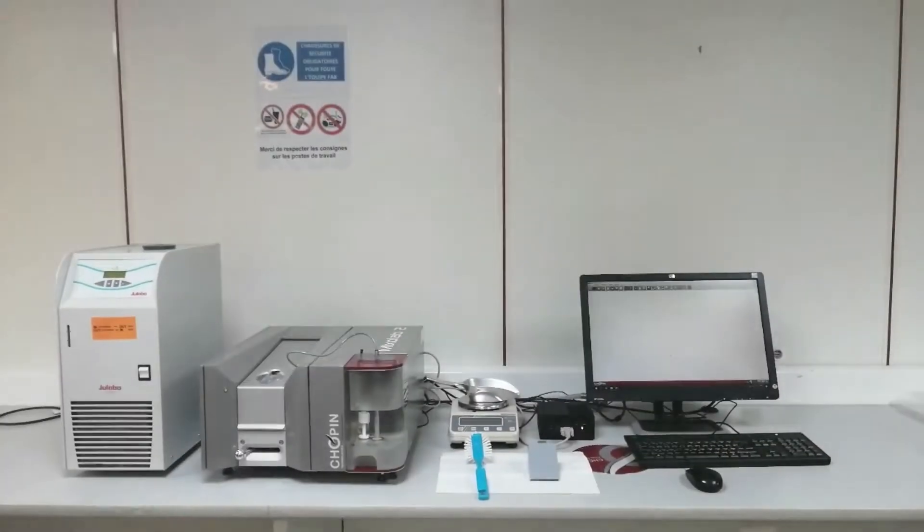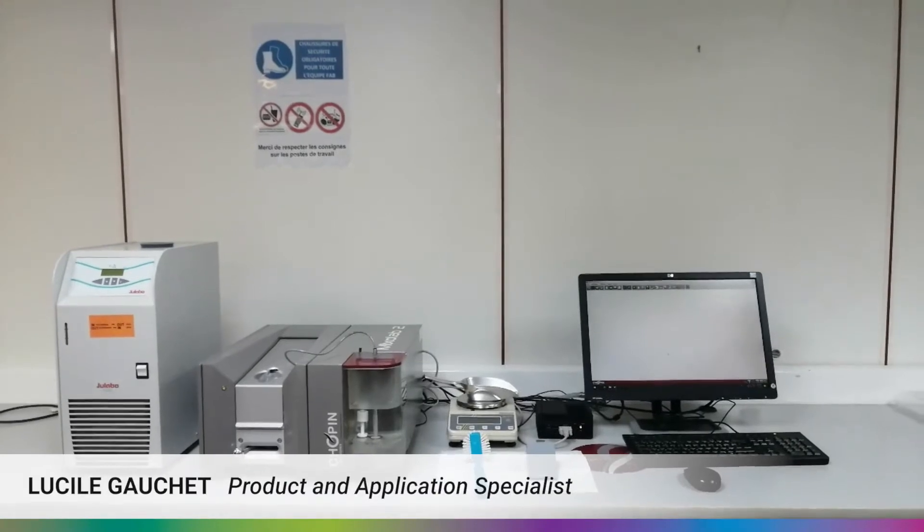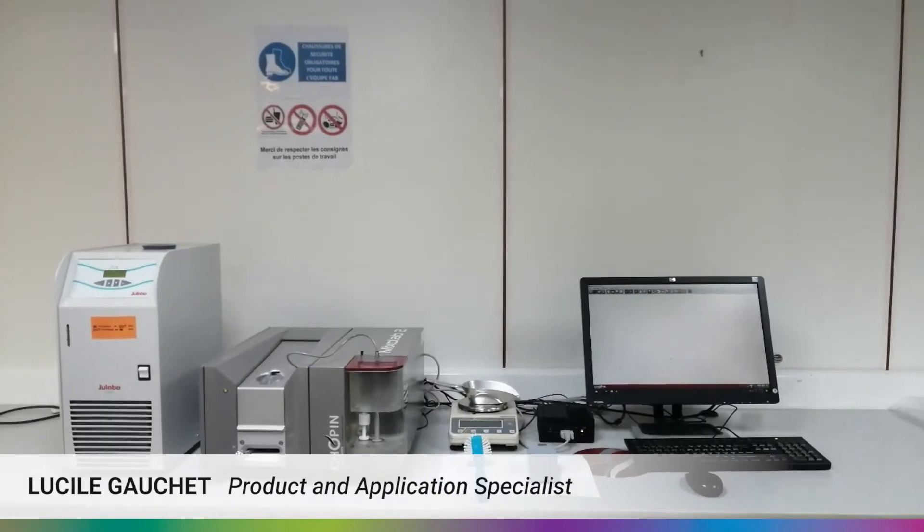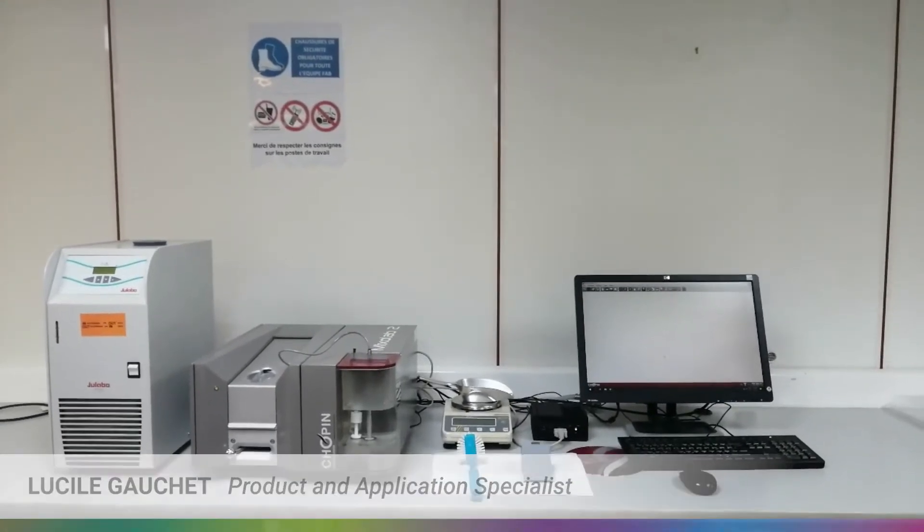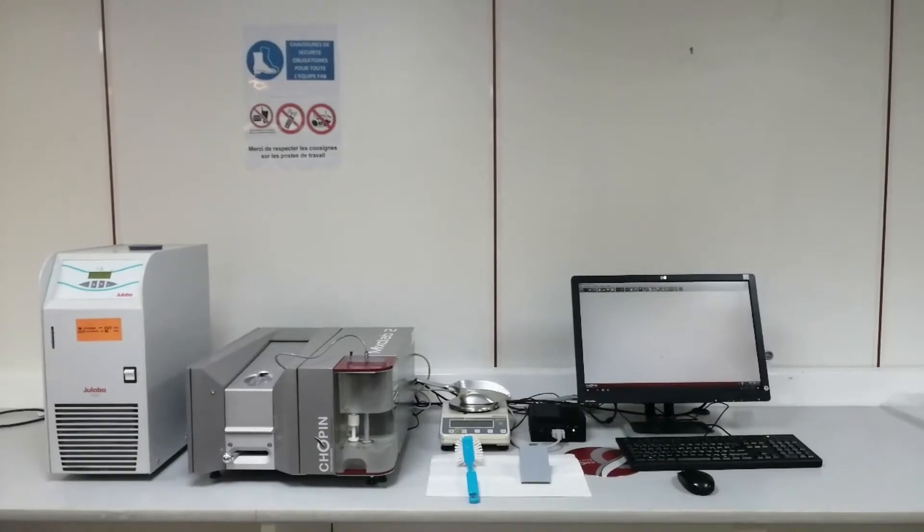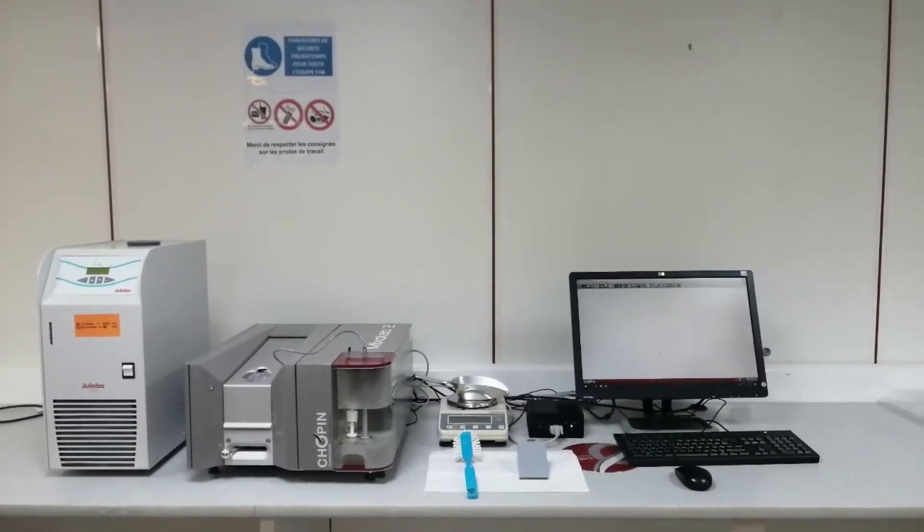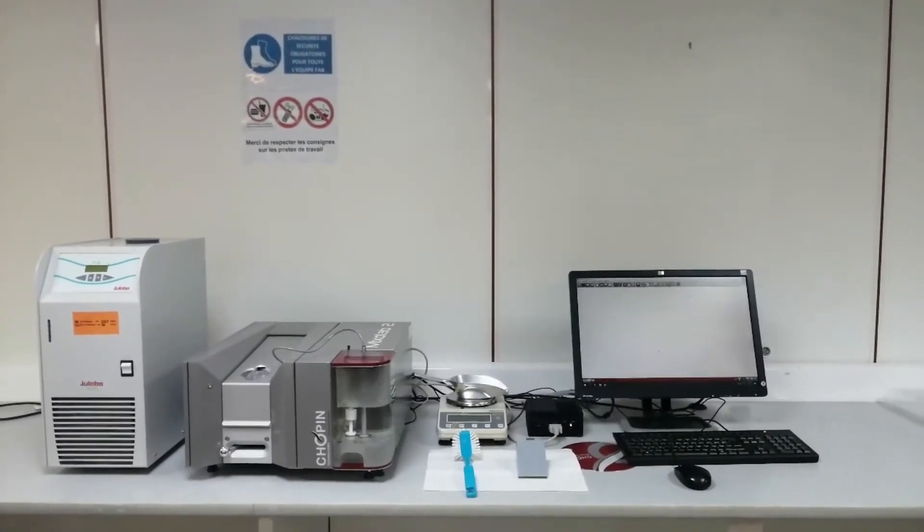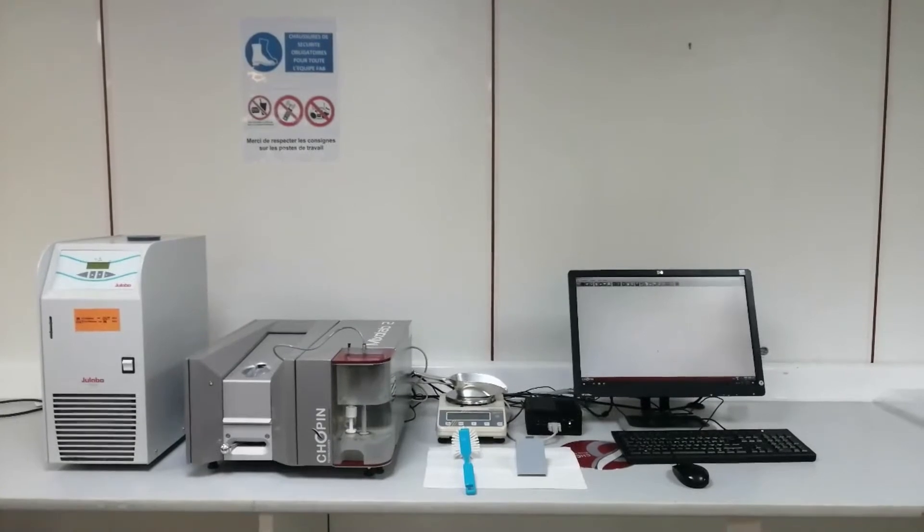My name is Lucille Gaucher. I'm product and application specialist for Chopin Technology. Today we will be going over the Mixolab, a device for measuring the rheological characteristic of a dough during mixing.